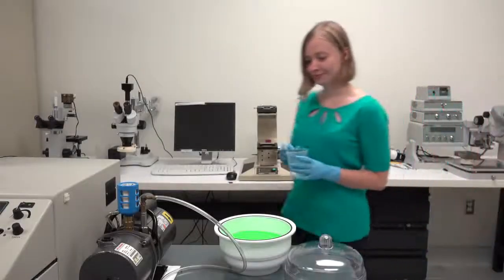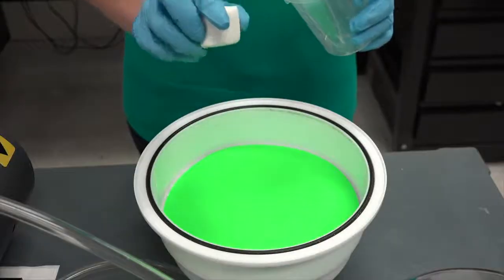I'm now in the sample prep lab outside of the clean room. We have put a marshmallow into the chamber because it will expand as the pressure in the chamber drops. This will enable us to see how the pressure is changing in the chamber as we pump the chamber with the mechanical pump. The chamber needs to be sealed so that air cannot get in when we pump it down and remove the air.